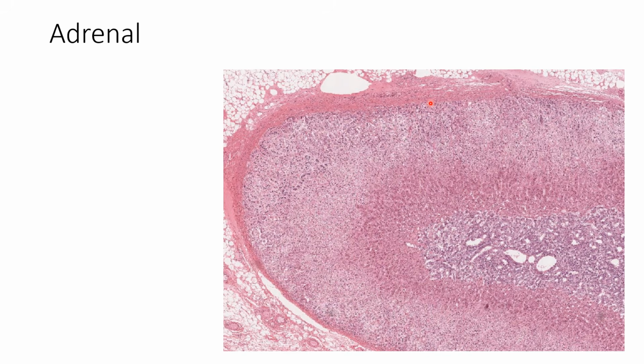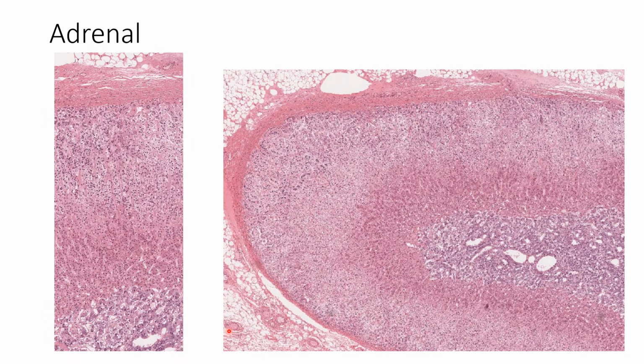All right, this is just an adrenal gland. This is just a bigger section than what you've seen. So this is either a transverse side to side cut or a top and bottom cut. Let's just say it is a top and bottom. So this is the top of the adrenal gland. This is the bottom. So they cut straight through, and what you have seen before, they just go top to middle. So this is the picture I showed you before. See this hole here? It matches up with this hole here. The smaller picture is just a cropped version of this larger picture.